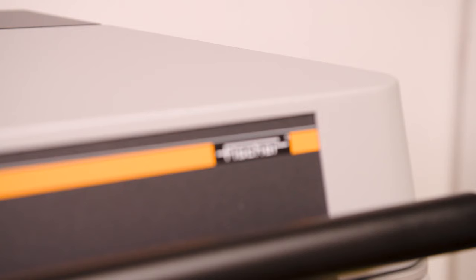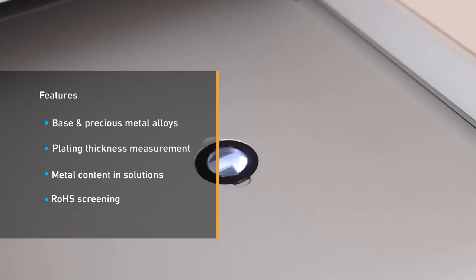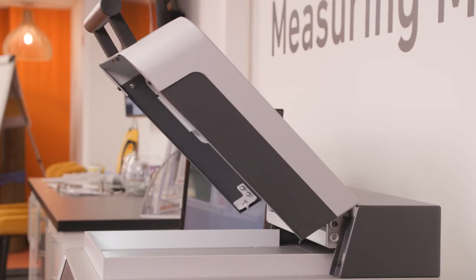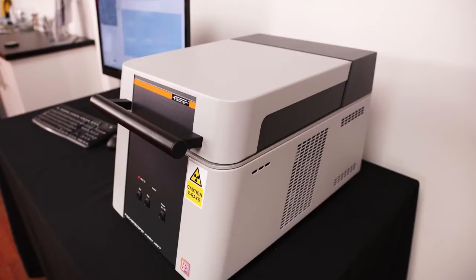Its scope covers base and precious metal alloy analysis, plating thickness measurement, analysis of metal content in electroplating solutions, and RoHS compliance screening. The smallest sample areas can be analysed thanks to a microfocus X-Ray generator, and a range of X-Ray beam sizes provides optimum performance for a wide range of measurement tasks.